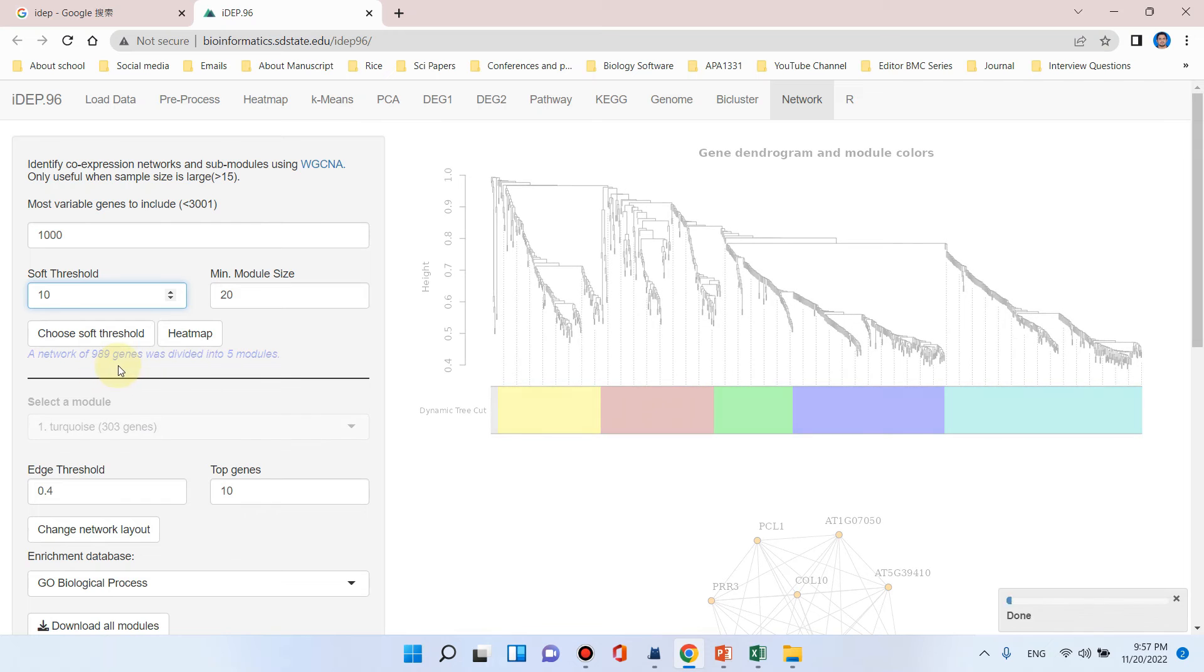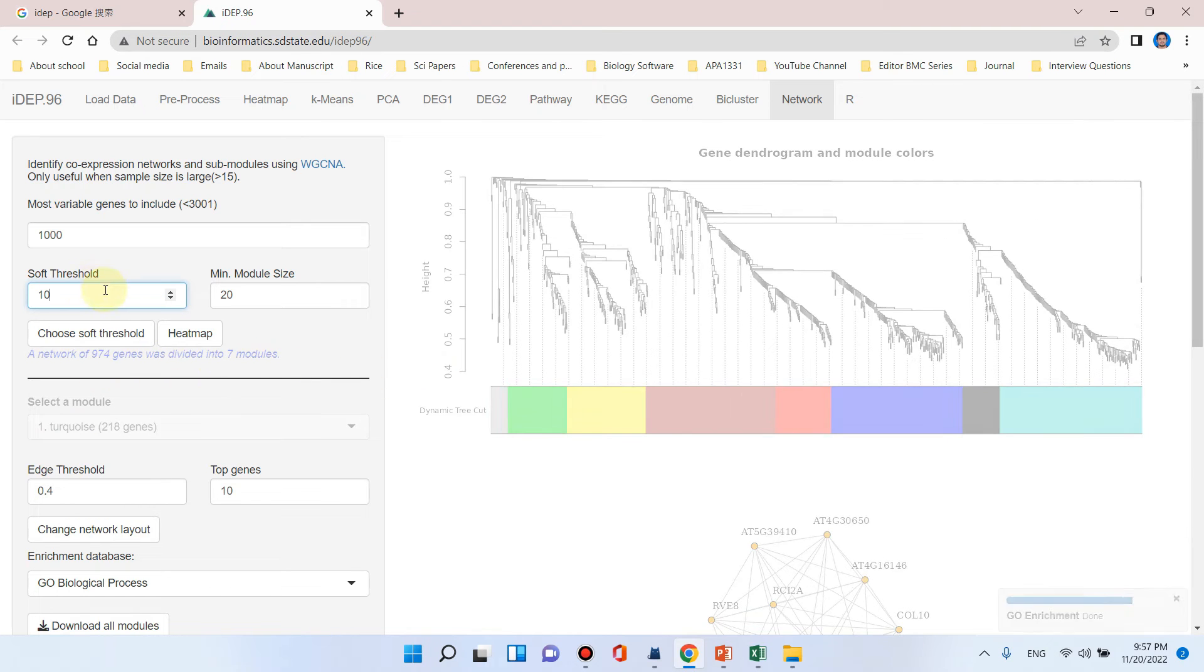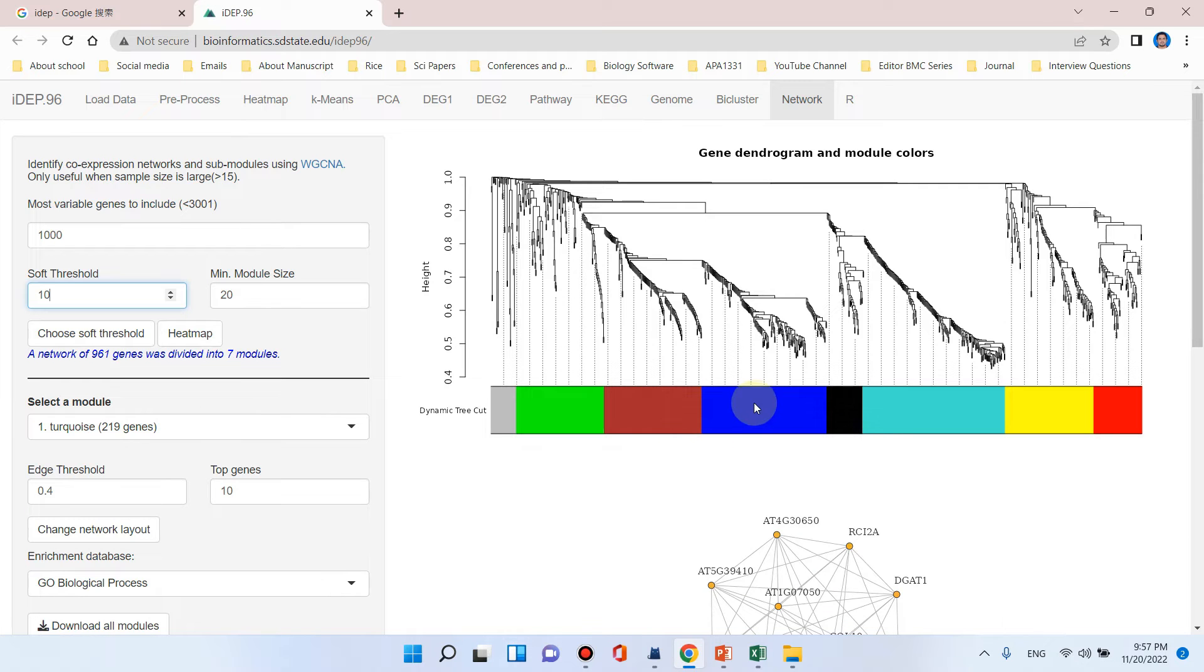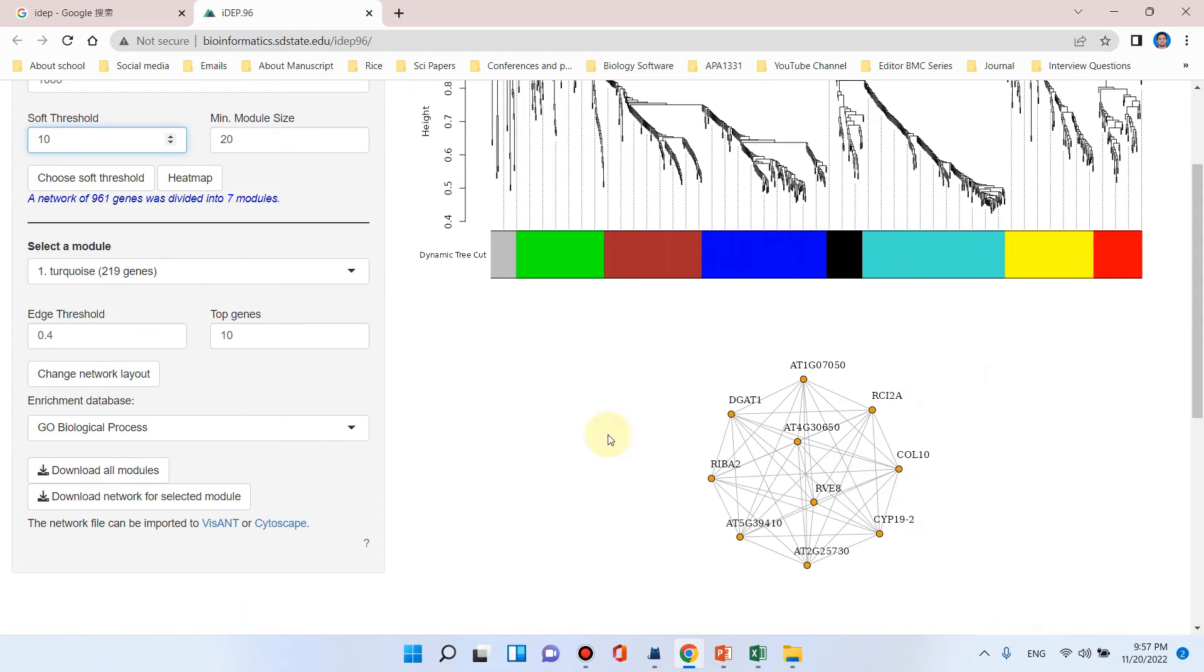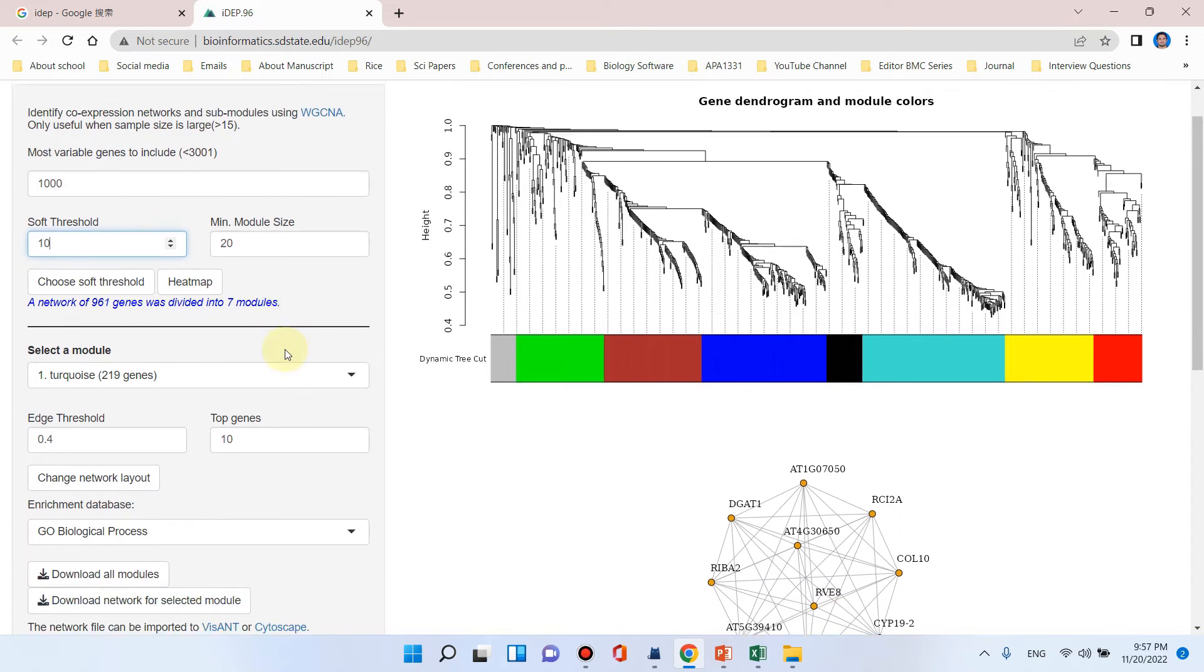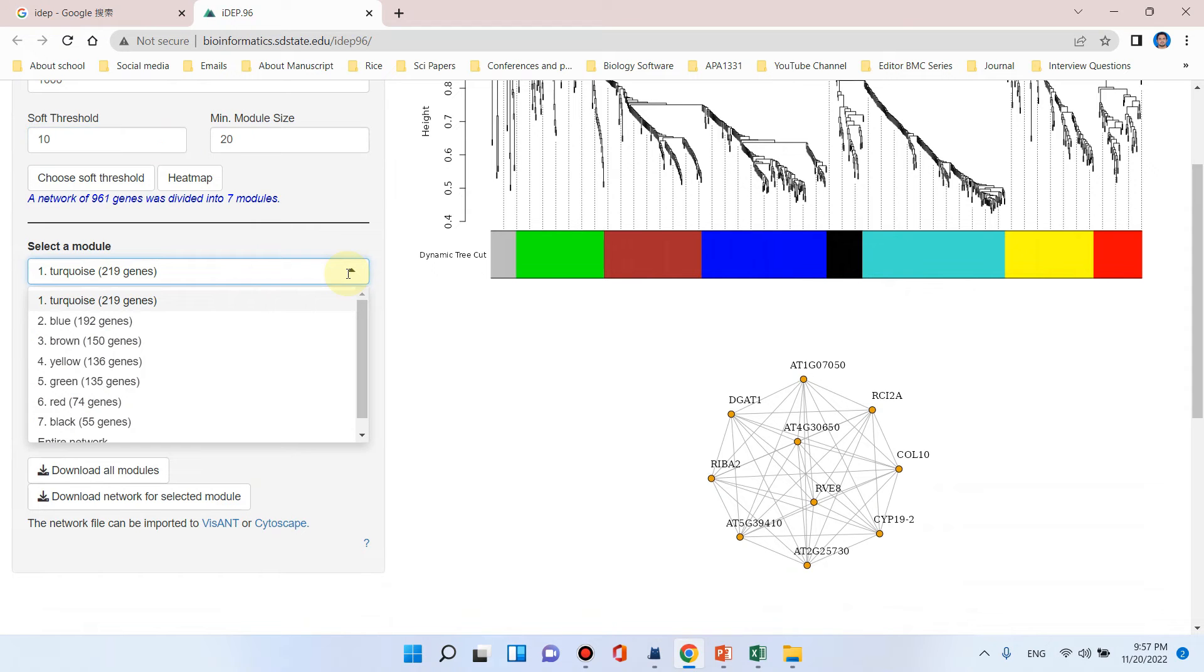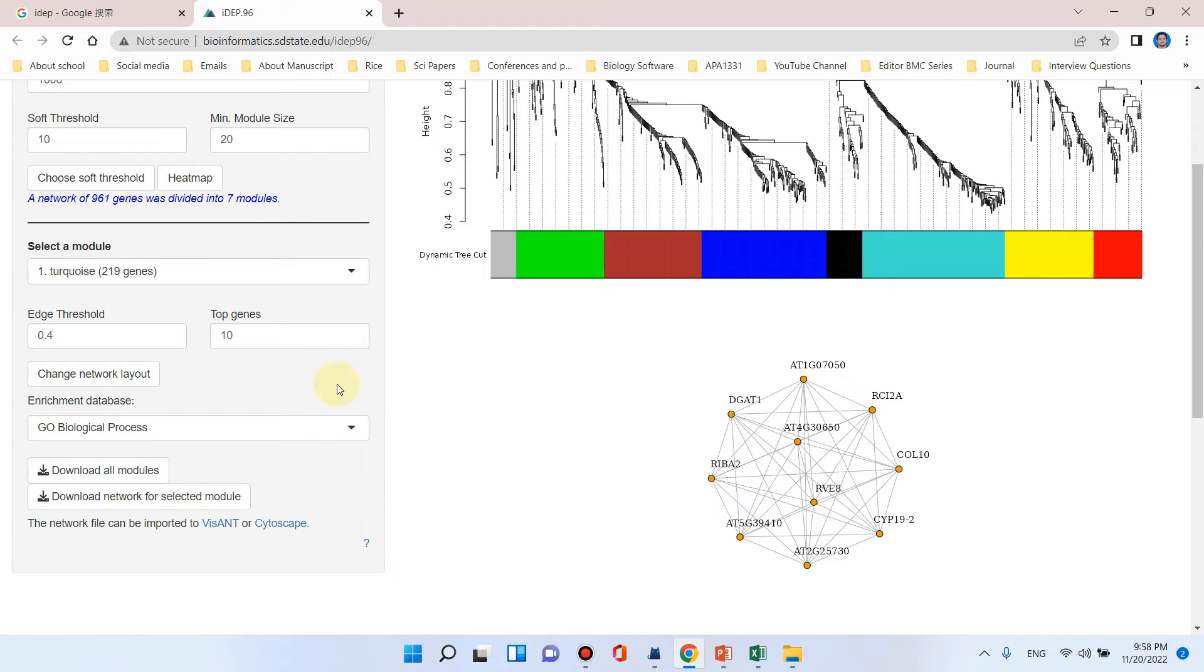We can simply increase soft threshold to 10 and see how the network of all the genes is divided into how many modules. As we increase the soft threshold, the number of modules is also increasing. You can see it is automatically updating in the background and creating new modules. Here at the soft threshold of 10, a network of 961 genes was divided into 7 modules. Interestingly, each module can be seen separately: 1, 2, 3, 4, 5, 6, and 7. The first one is turquoise module which has the highest number of genes, 219 genes. Blue has 192 genes, and similarly all the modules can be downloaded.